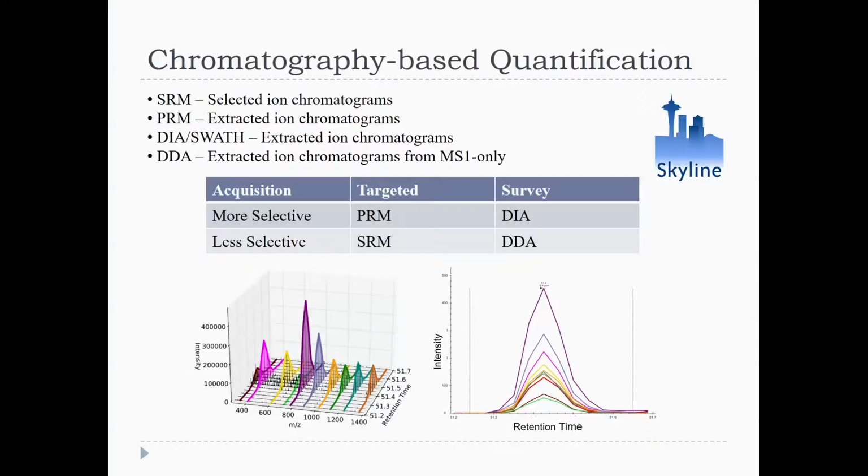Then we moved into PRM, and we had done a little bit of the DIA analysis, but then the Aebersold lab showed up at ASMS with SWATH, and we're like, oh, they're doing the same thing too. And also, the mass spec community has done this for like 20 years, extracting chromatograms from MS1. MaxQuant is probably the most popular example of this right now, but there's also Mascot Distiller. We adapted Skyline to do that as well. So Skyline can now do all 4 of these methods.